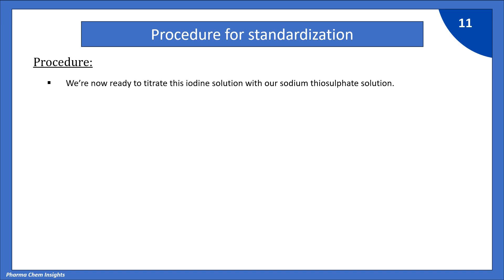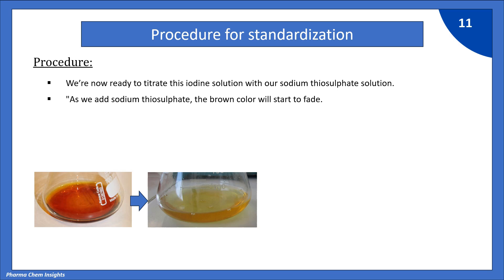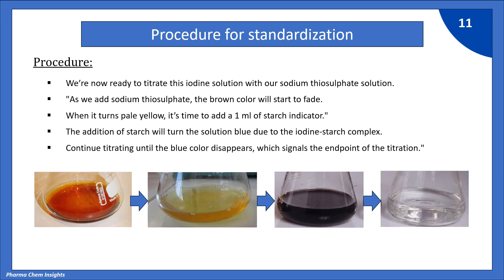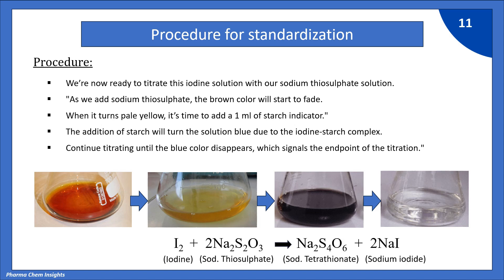Iodine is liberated and the solution turns dark brown. We are now ready to titrate this iodine solution with our 0.1 normal sodium thiosulfate solution. As we add sodium thiosulfate from the burette, the brown color will start to fade. When it turns pale yellow, add 1 ml of starch indicator — the solution will turn blue due to the iodine-starch complex. Continue titrating until the blue color disappears, which signals the endpoint. Iodine reacts with sodium thiosulfate to give sodium tetrathionate and sodium iodide.